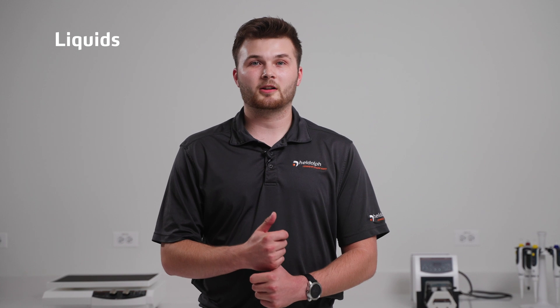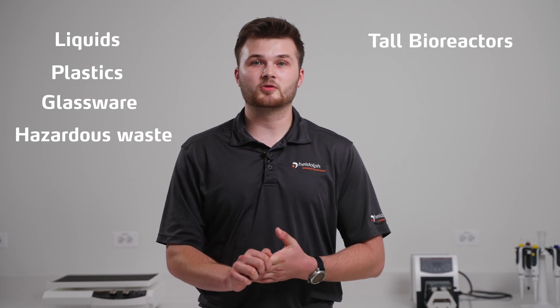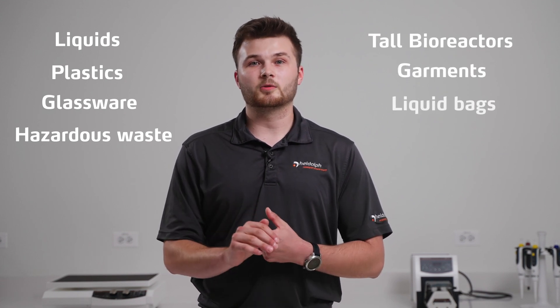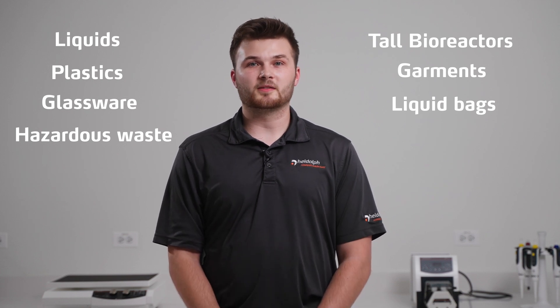For information on how to properly load liquids into your LabLine autoclave, please see our previous video. Whether your samples are liquids like broth, agar, or media, plastics, glassware, biohazardous waste, bioreactors too tall for benchtop autoclaves, garments, or sealed liquid-filled bags or bottles, there is a LabLine model to meet your specific application.